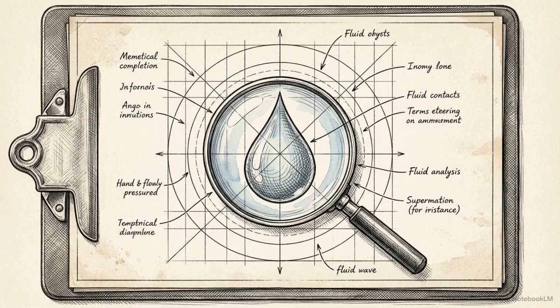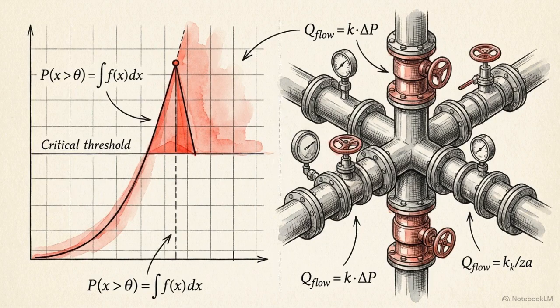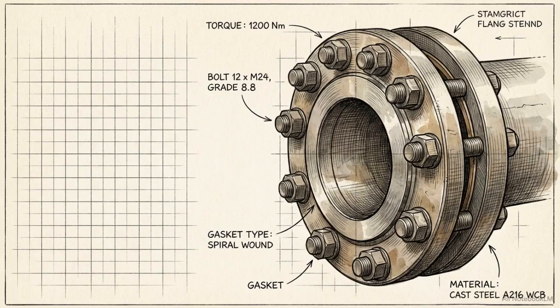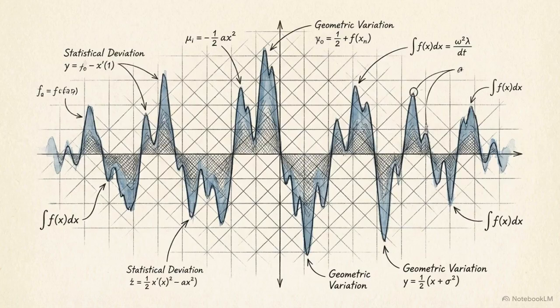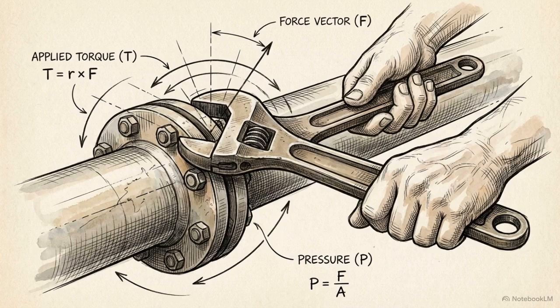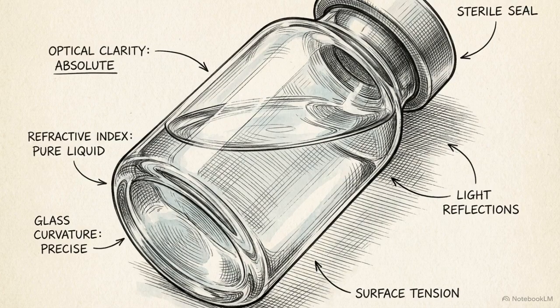You now have a complete diagnostic framework. You have calculated statistical process limits based on your own historical data, audited your physical piping geometry, and built a step-by-step root cause analysis checklist. Proactive engineering relies on 3 principles: trend your data continuously, track your system geometry rigorously, and treat the root cause immediately to maintain the purity of your drug products.